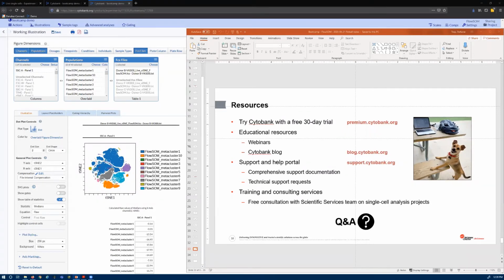And there are some other differences versus visualization, right? So both SPADE and FlowSOM use minimum spanning tree for visualization. However, FlowSOM has a lot more visualization, like the pie chart, the grid. Also, FlowSOM has a second clustering step, the metacluster step, that SPADE doesn't have. However, SPADE has the interactive minimum spanning tree where you can highlight channels one at a time, and you can do bubbling. So it's a different process of visualizing your data.